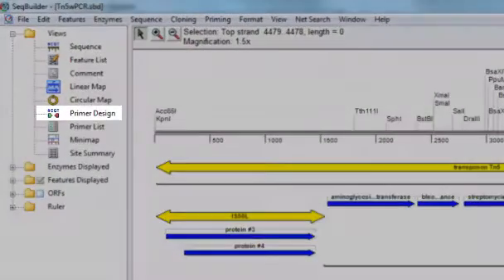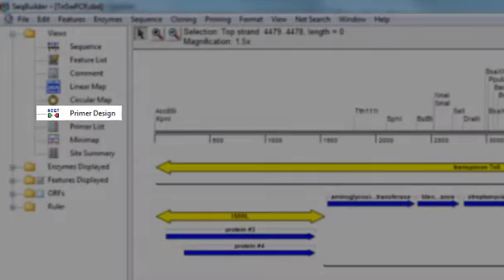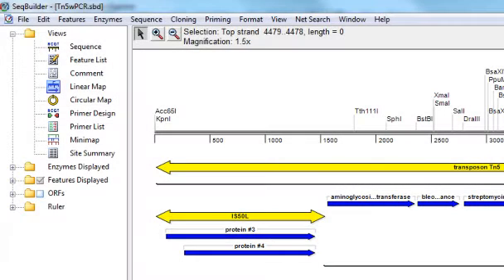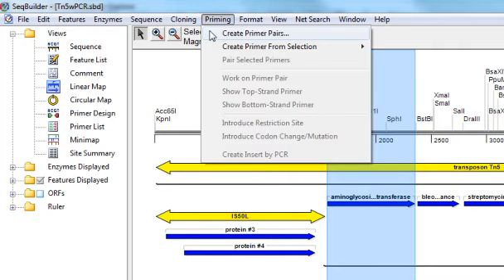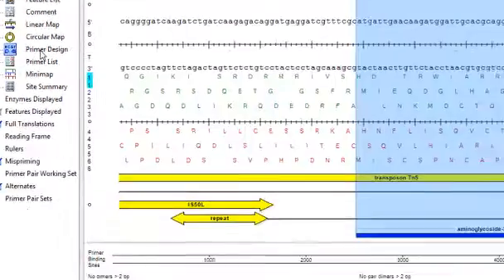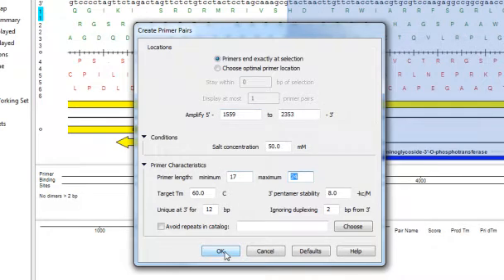The Primer Design view allows you to design and analyze primers for your sequence. Typically, before accessing this view, you would select the region of sequence you want to amplify. So I'll select the sequence associated with this feature here in the linear map, and then I can either select Priming, Create Primer Pairs, or just click on the Primer Design view from the curtain. I'll click OK for SeqBuilder to start the Primer Pairs search.